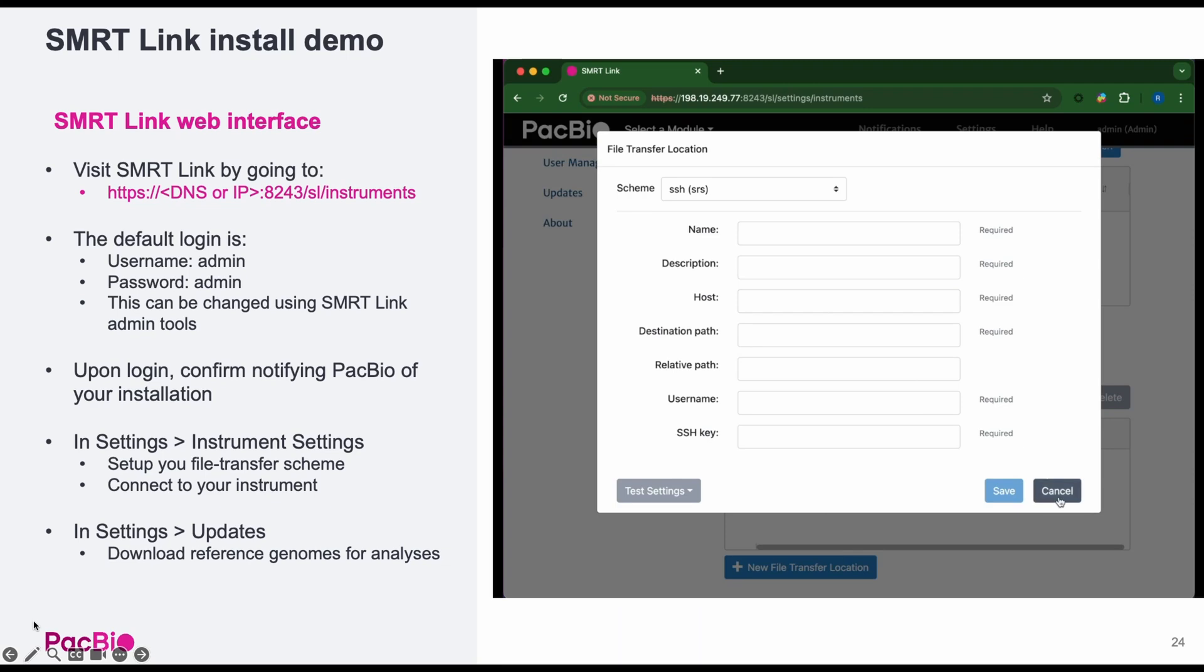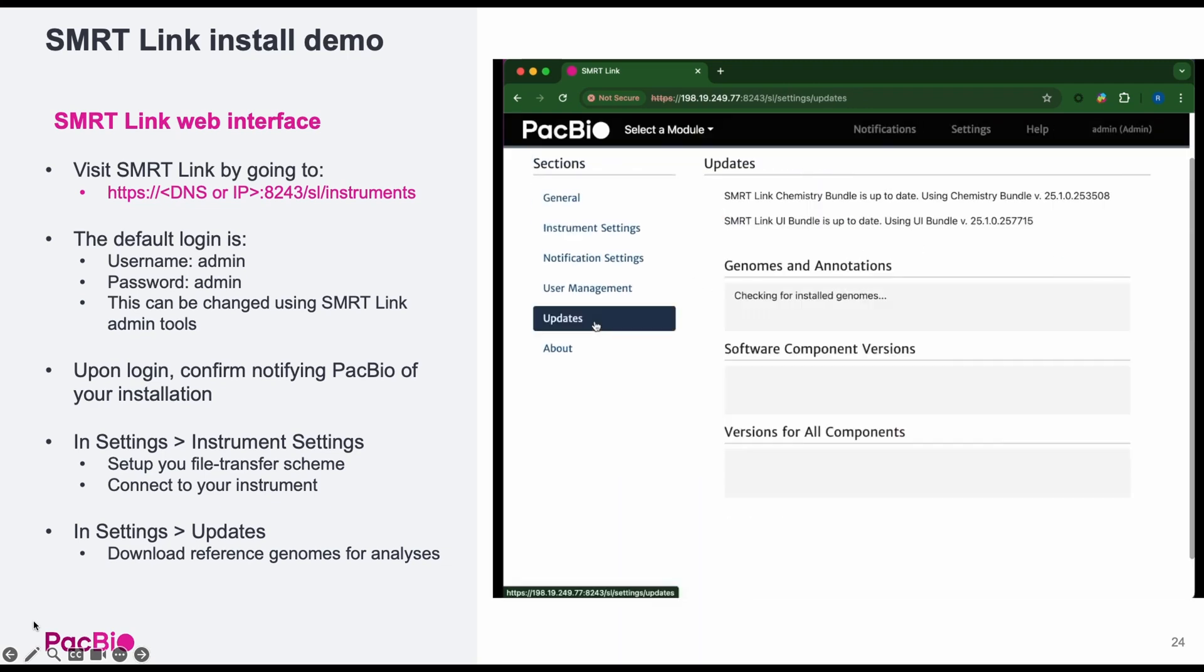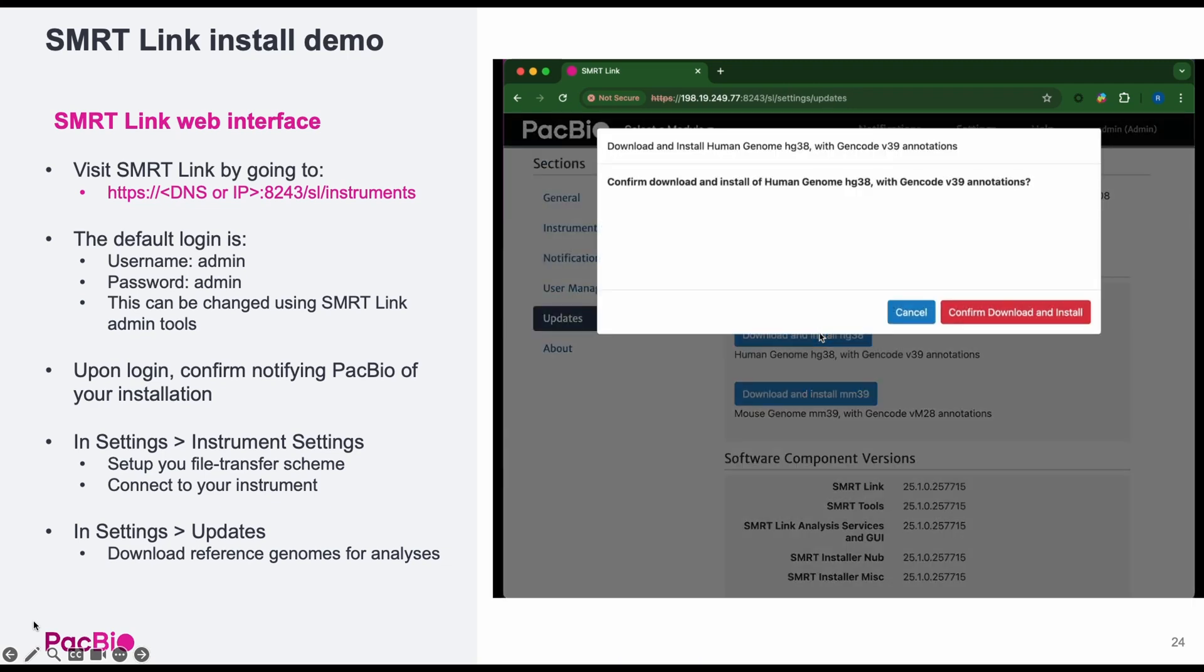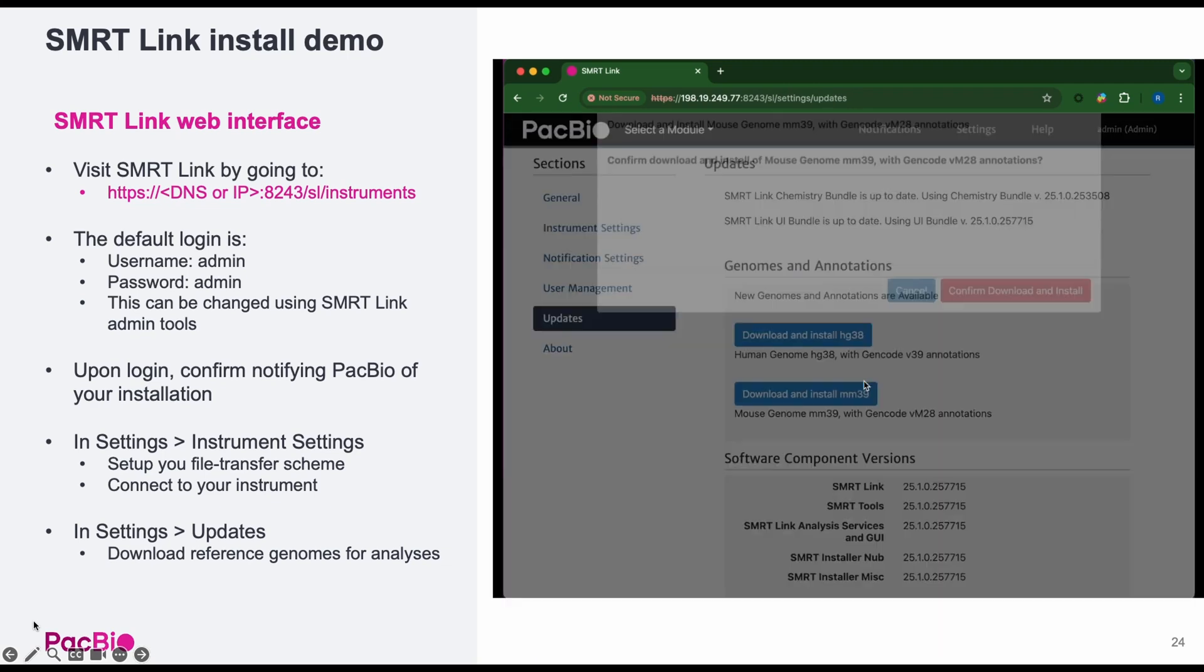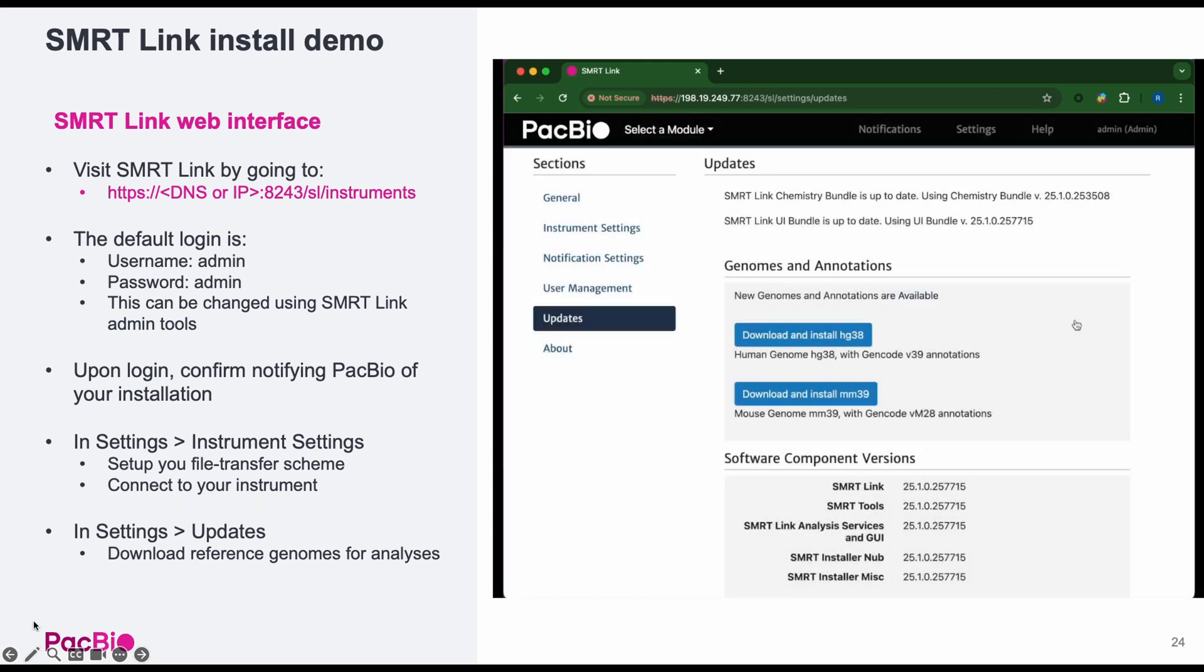In the settings, you'll find additional useful information such as where you will set up the transfer scheme and set up your instruments. You'll also find settings for managing users. And under updates, you'll find the ability to download and install the human and mouse reference genomes, which are useful for smart analysis workflows.